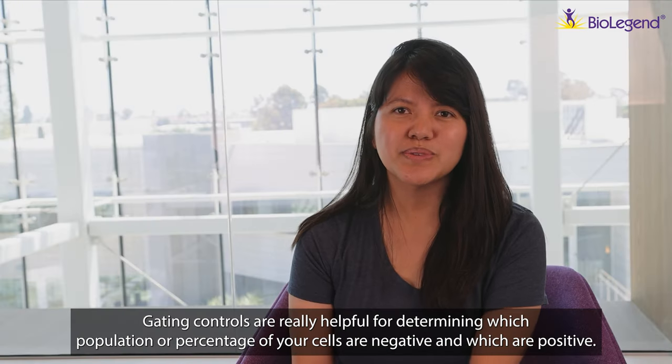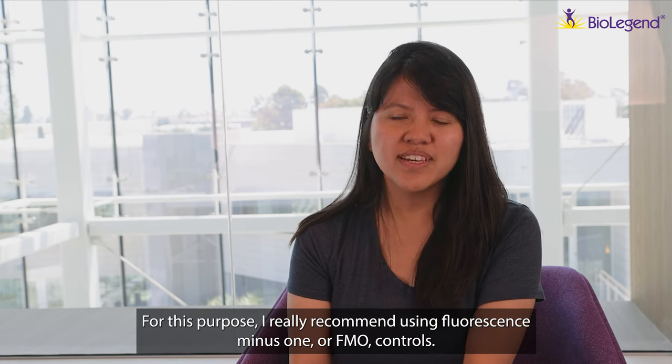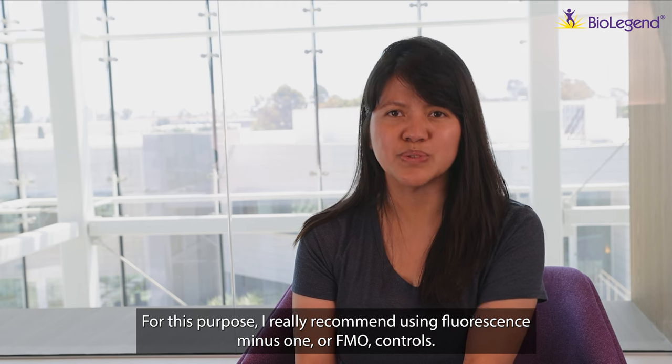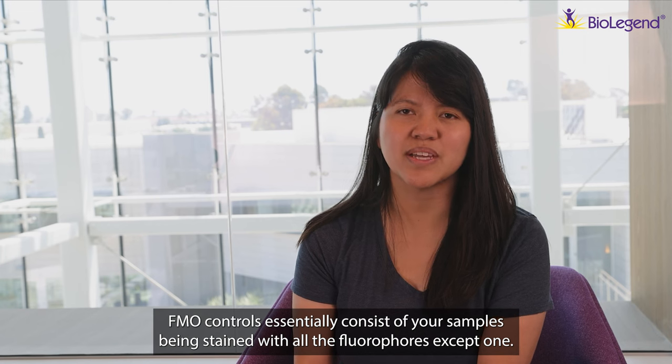So gating controls are really helpful for determining which population or which percentage of your cells are negative and which are positive. And so for this purpose, I really recommend using fluorescence minus one or FMO controls. FMO controls essentially consist of your samples being stained with all the fluorophores except one.